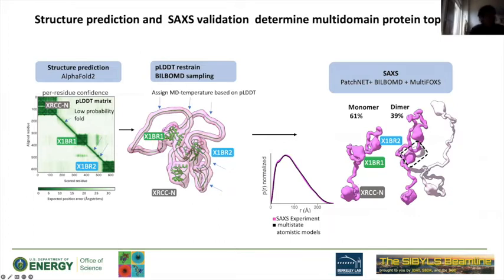And on top of it, the SEC-coupled SAXS shows that this protein is not in a monomeric state. But also from the molecular weight, we see it's not in a dimeric state. And from the broadening of the peak, I don't have a picture here, and we will show in our tutorial that's exactly what happens for lots of proteins, this is a monomer-dimer mixture.